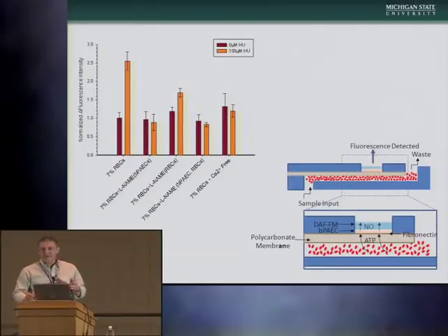But the one thing that I'd never done is shown the downstream effect of that ATP. And so when Sarah Lockwood joined my group, at the same time Jada did, I put them on this project, and I said, let's see if we can finish this little in vitro study up and show that that ATP is actually resulting in a nitric oxide increase in the endothelium. And so just recently, Sarah has used sort of our workhorse microfluidic device here to actually show the interactions between the red cell-derived ATP and the endothelium NO shown here. And she's found some really interesting results.